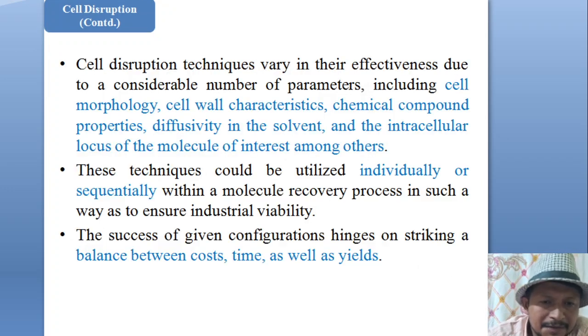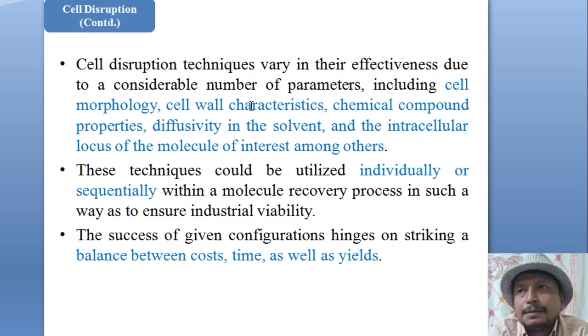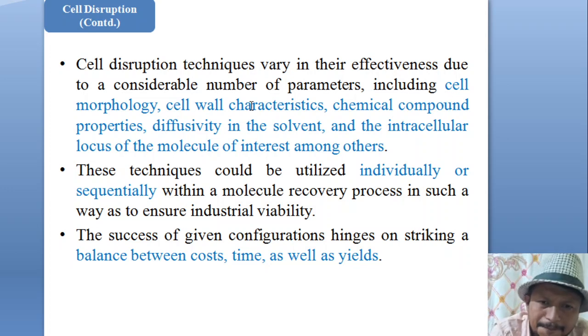Lastly, we have understood that the cell disruption techniques have to be carried out in such a way that there is maximum yield, the time frame is very short, and we have minimum cost involved in the process. Again, we have understood that we can use the cell disruption method individually or sequentially.